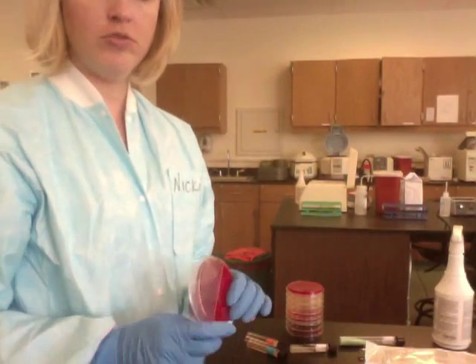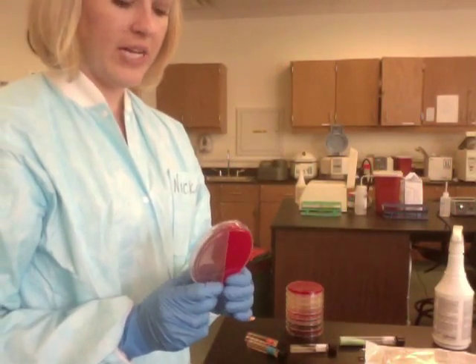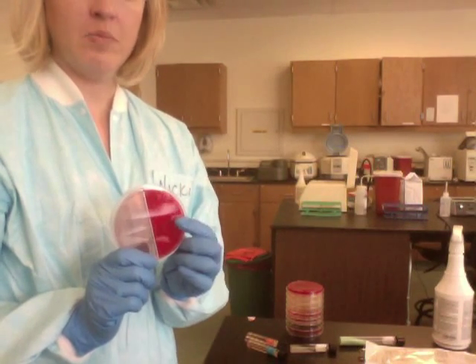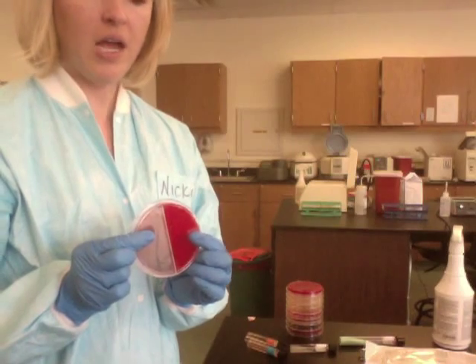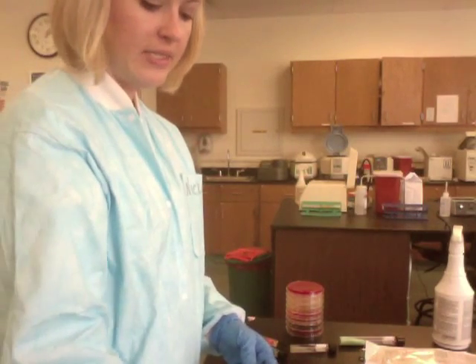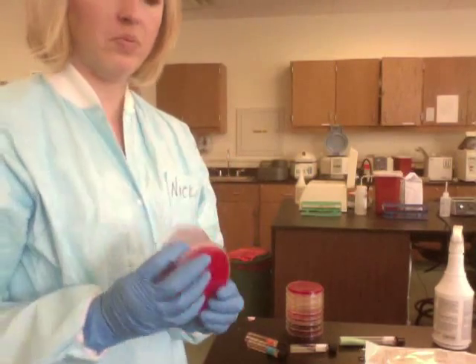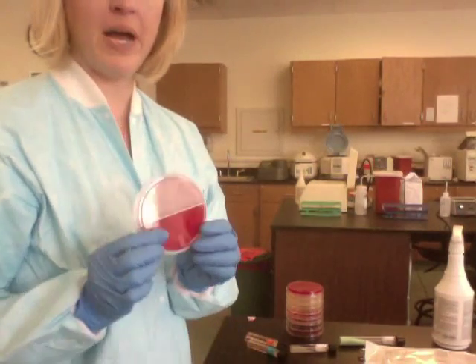Today I'm going to show you how to streak for isolation on a urine plate. This is a bi-plate — it has blood on one side and MacConkey on the other. You can also see it set up with a whole blood plate and a whole MacConkey plate, but the norm is the bi-plate.